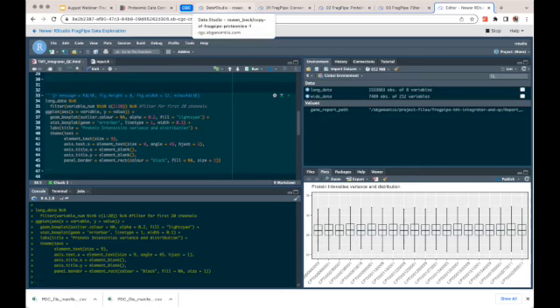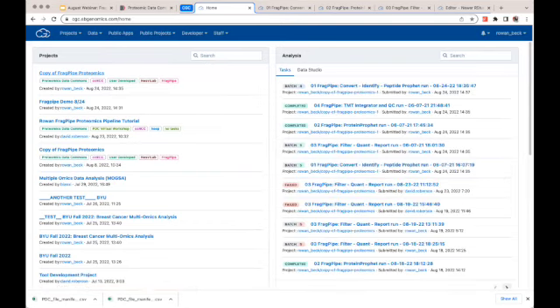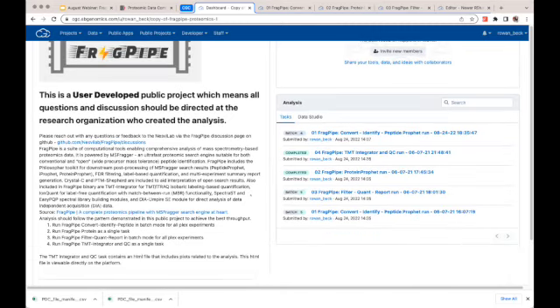Well, I believe when I see the screenshot, we can screenshot from CGC. I believe it's from the FragPipe 15. Right now we have the FragPipe 18, which basically have more functionalities compared to the other versions, as I presented at the beginning. But yeah.